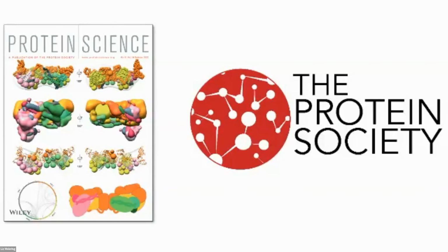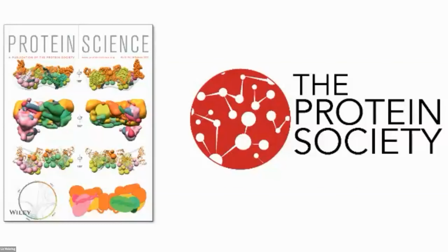I guess I'm going to also ask one myself. It links to some of the questions that are in the chat. So you said you were looking for amyloid, but you didn't see it. Instead, you found a viral infection, I guess. So what are your thoughts on why you would or wouldn't see amyloid? And how similar, this is a question in the chat as well, Christian Wilson has asked this, are the structures that you might see in vitro and in vivo, and when do you get crazy differences?